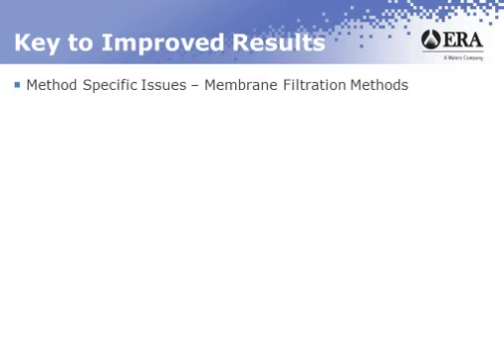All right, keys to improved results. Want to get into some method-specific issues. Membrane filtration methods.